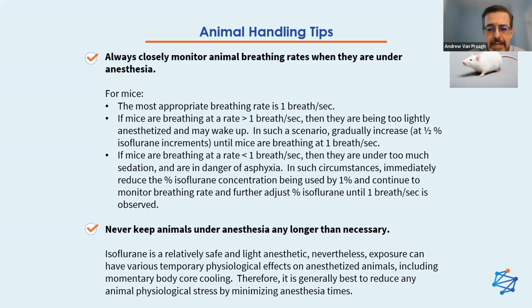Now, anesthesia in the form of the inhalable isoflurane is a very light and relatively safe way of doing animal anesthesia. Nevertheless, it does have an effect on the overall animal physiology. Never mind breathing rate, there's the body core cooling that will happen. And the common sense rule of thumb is never to keep a mouse underneath anesthesia for longer than you need to.